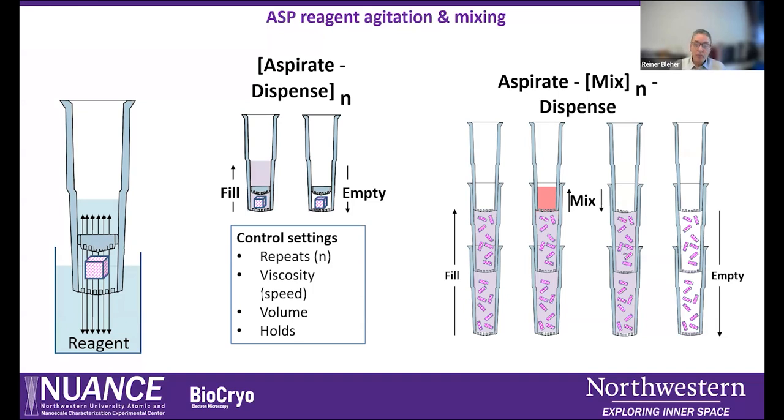There's also the possibility to stack capsules, if we have quite a lot of sample to process at once. For stacked capsules, we have another command called mix. Once the capsules are filled, we move the whole liquid column up and down, for a defined volume of liquid, until the media is dispensed again and we are ready for the next aspiration cycle.